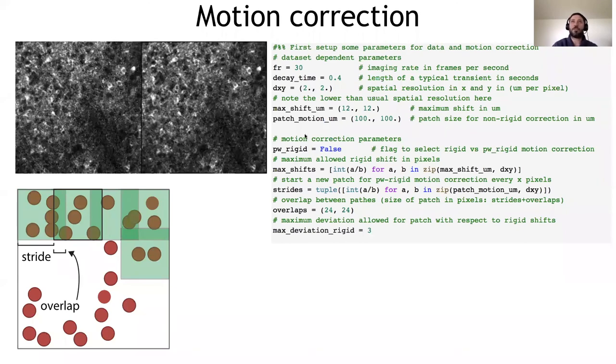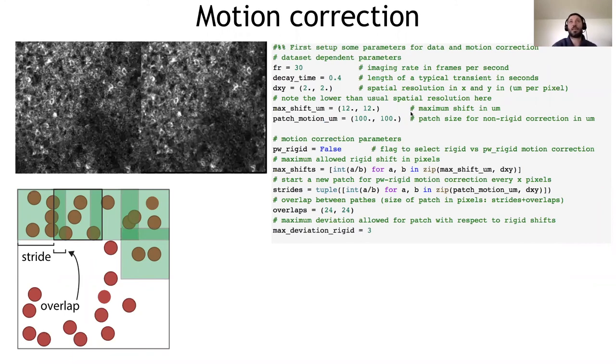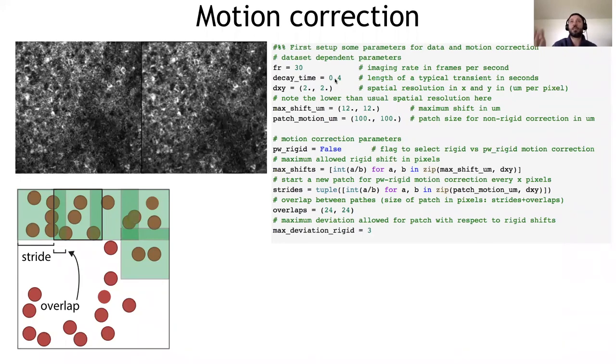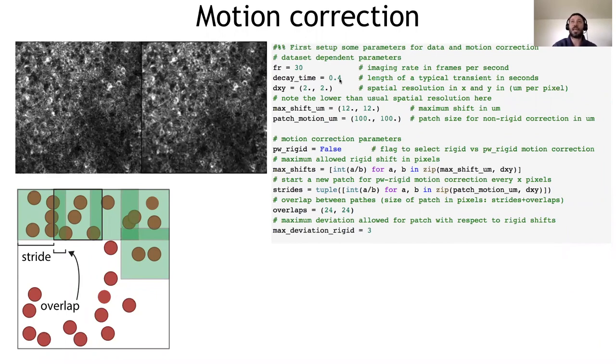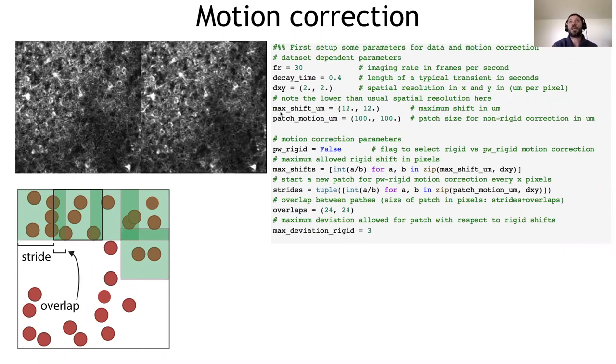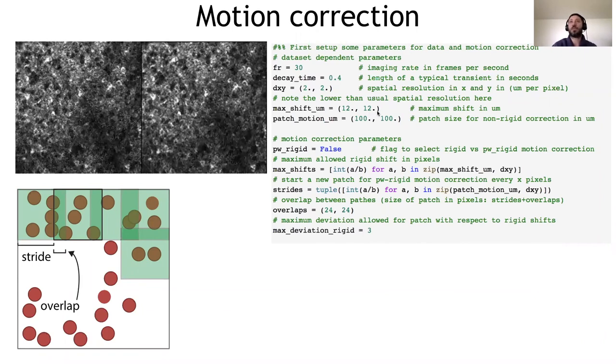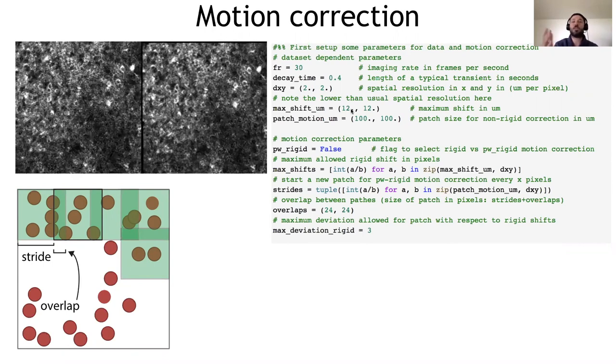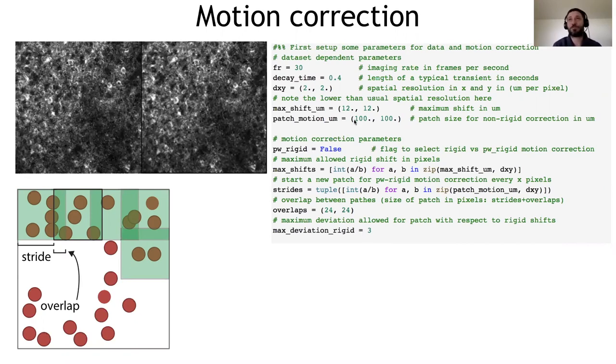So we have an approximation of this operation. We basically tile the field of view with these little patches. We motion correct each of them. And then we merge everything into this movie. On the right, you have a set of parameters that you want to use when you perform motion correction and in general when running CaImAn. Frame rate, 30 Hertz in this case, the decay time is typical of the indicator that you're using. They might be, for instance, in this case, GCaMP6F. This is their spatial resolution in X and Y pixels. And this is the maximum shift that you are allowed.